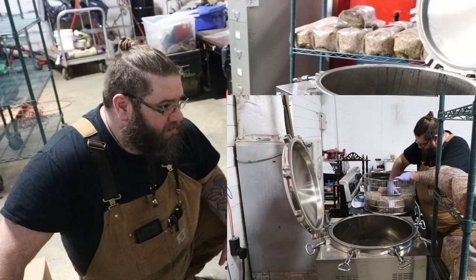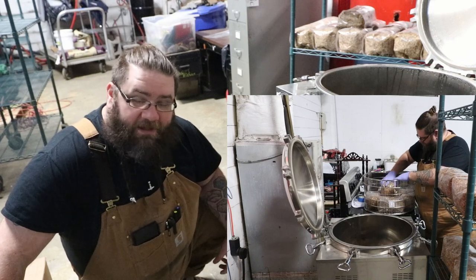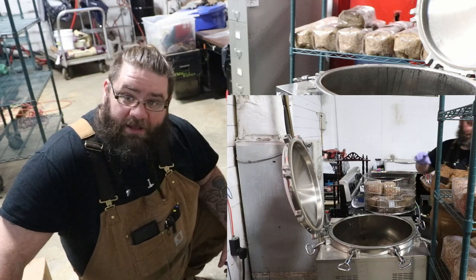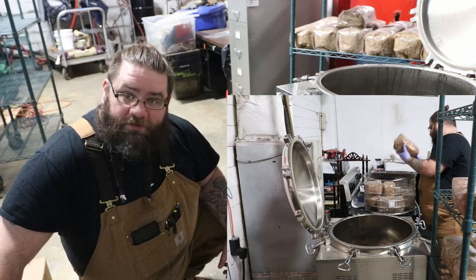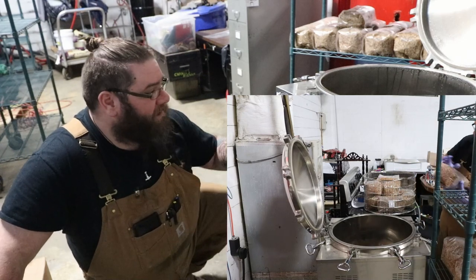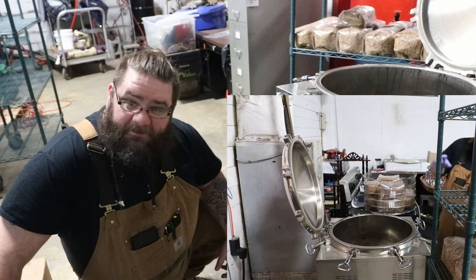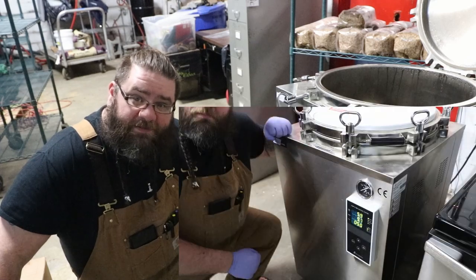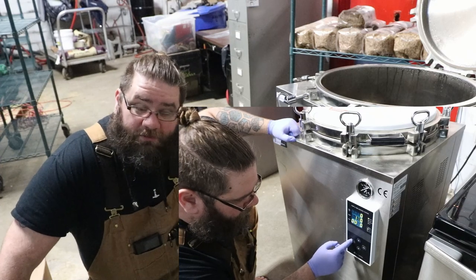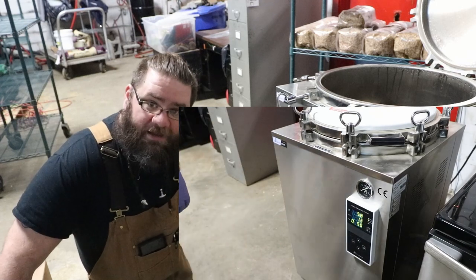Anyways, this autoclave is 150 liters. It can hold 23 5-pound bags in the 14T bags, the 5-pound grain spawn bag that's got the 0.2 micron filter patch. Sorry about the construction noise. They're making baggers down there right now. Anyways, the point is, this thing can cook those 23 bags in 50 minutes at 130C. That's 266 degrees Fahrenheit, and that is the power of autoclaves. Autoclaves are usually able to do much higher temperatures, which means faster reduced time cycles.